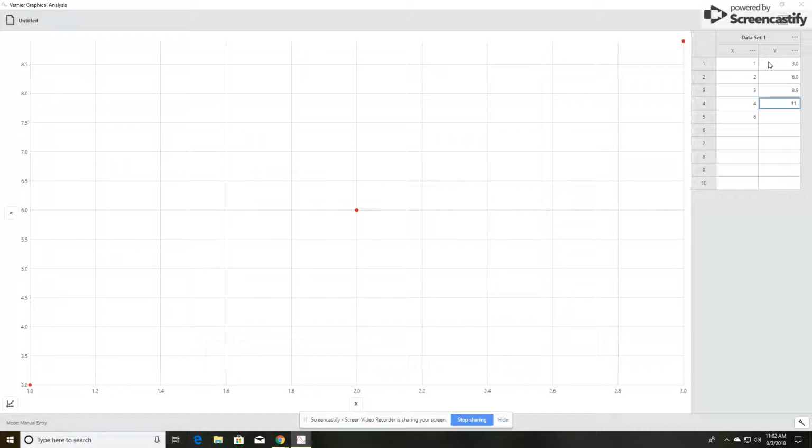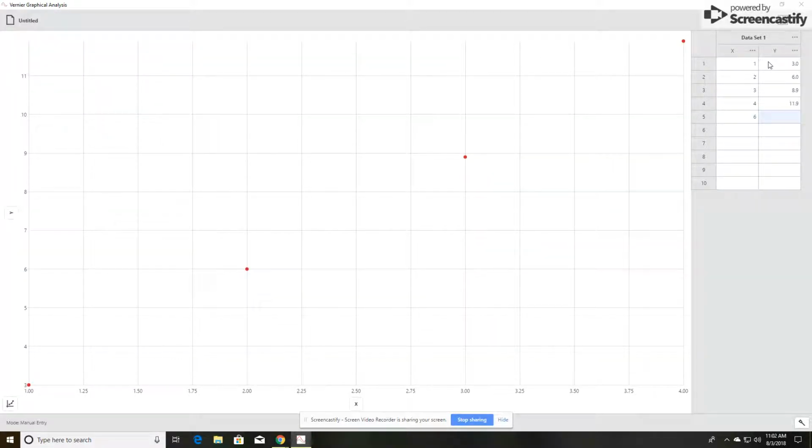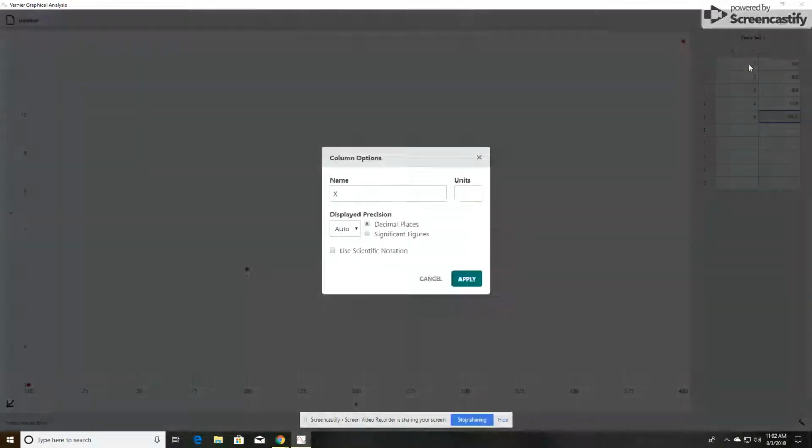Let's do 18.2. Okay. Now, this graph really isn't very acceptable, but we need to put out what's on the X and the Y just for fun. Let's call this column options. And again, I'm just giving you the basics here, just the tip of the iceberg. If this is the x-axis, let's call this volume, and we never want naked numbers.